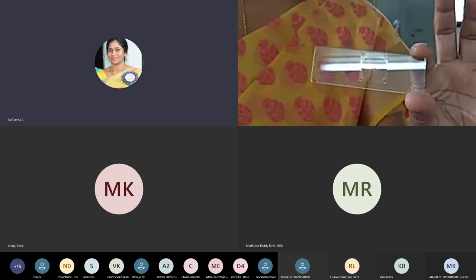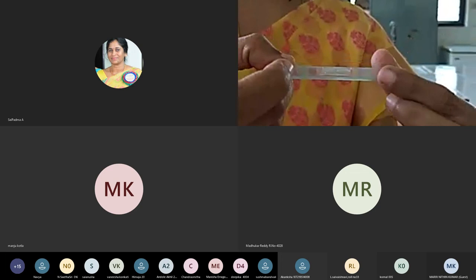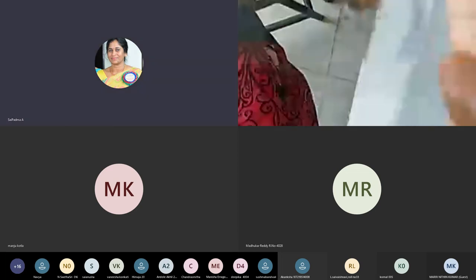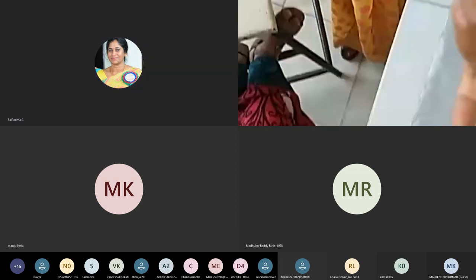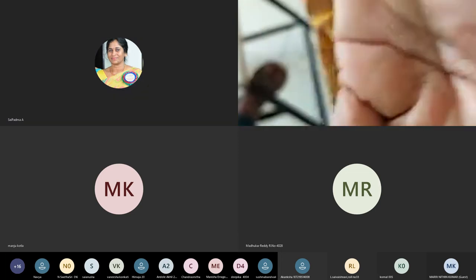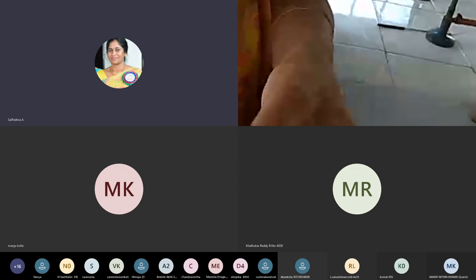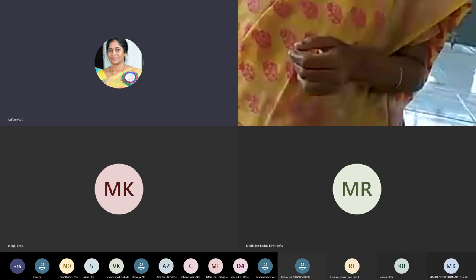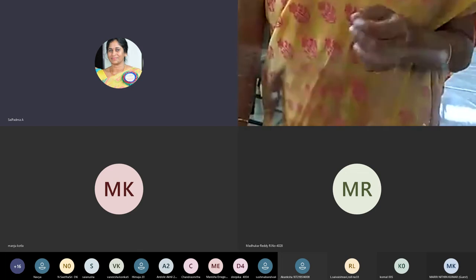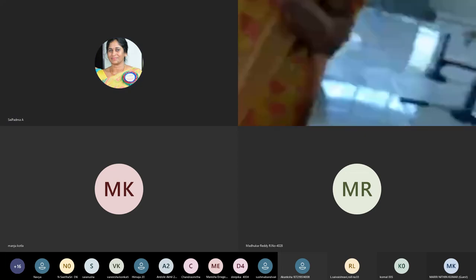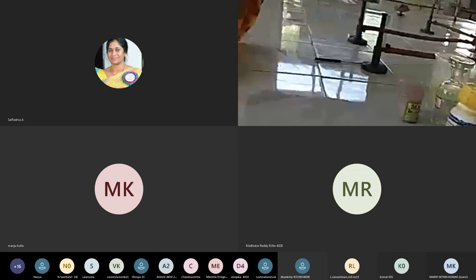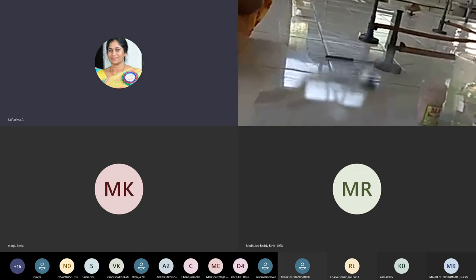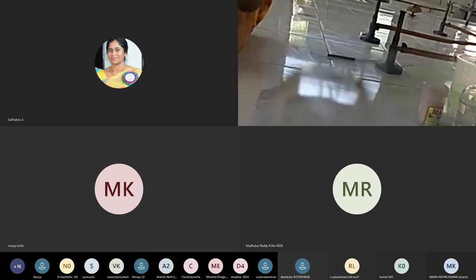The sample is now ready. The drop is hanging from the cover slip into the depression below. Make sure to use only a very small drop, because a large drop will touch the tip of the depression slide — the drop should be hanging freely and must not touch the cavity of the slide.